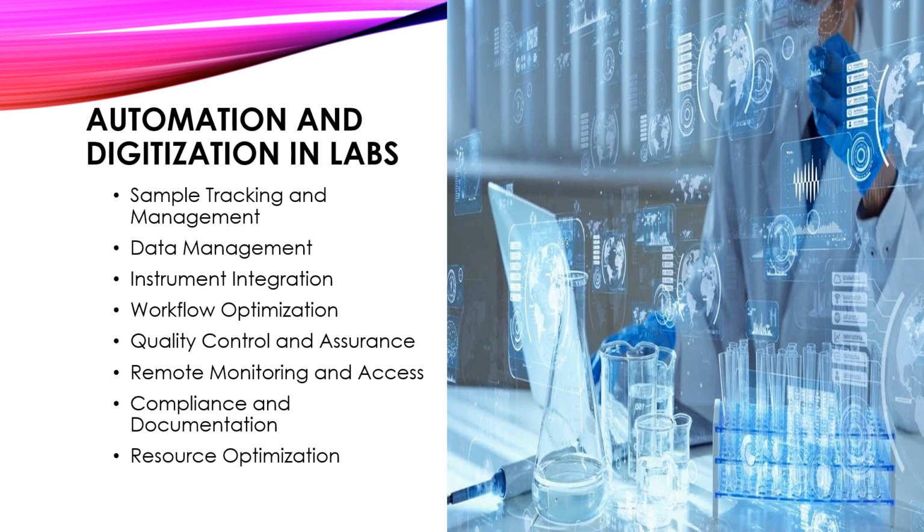Instrument integration. Automation enables seamless integration of laboratory instruments with data management systems. This integration allows for real-time data collection, analysis, and reporting, reducing manual errors and enhancing the reproducibility of results.